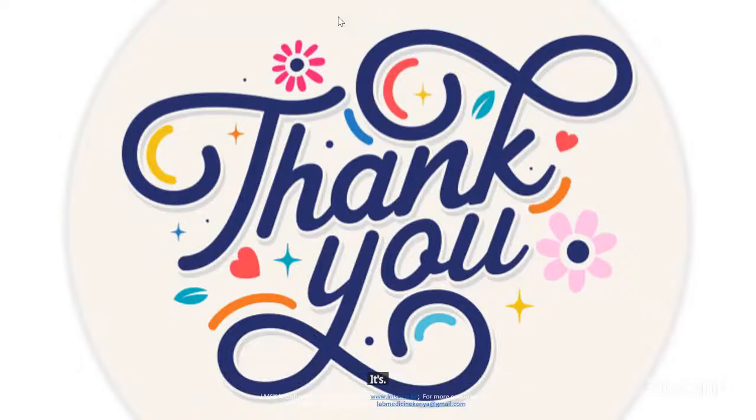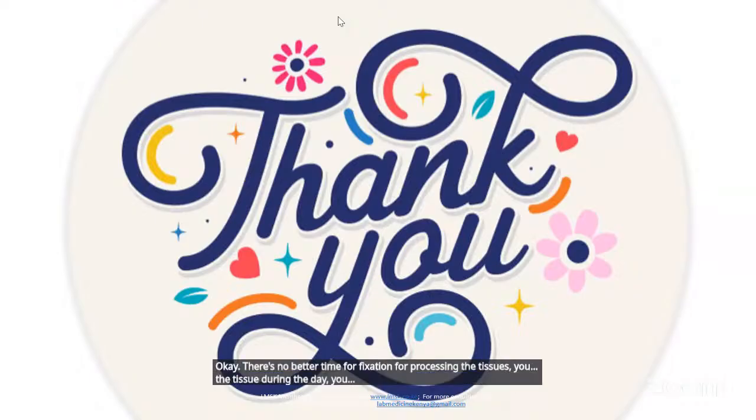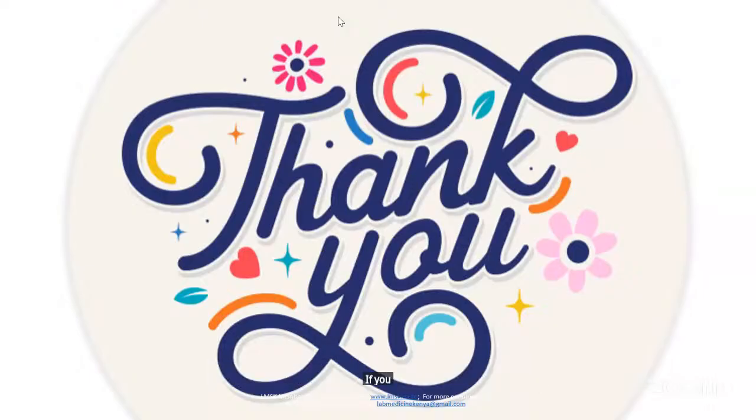There's no best time for fixation or for processing the tissues. You can process the tissue during the day or during the night, provided you are sure that your tissues are well fixed. If you have received very small samples and you have time during the day, you can process them, whether manual or automated. There's no best time for processing, provided the tissues are well fixed.